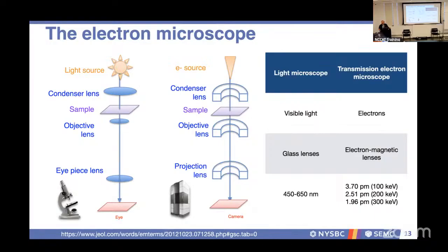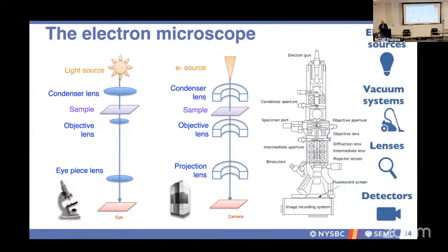Unfortunately, unlike light microscopy, where numerical aperture lenses are on the order of 1 or 0.9, or you can even have immersion lenses with even higher NAs, in electron microscopy our NAs are really poor. They're somewhere around a 1,000th of an NA. So despite us having picometer wavelengths, we might only be resolving around the angstrom level. And that is actually very good because biology is usually around the angstrom level.